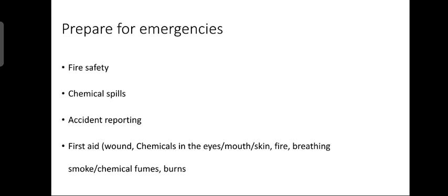Now let us see accident reporting. All injuries shall be reported to laboratory staff. Minor injuries many times are not reported because they are perceived to be embarrassing or that careless actions might have led to the accident. However, minor injuries can sometimes lead to more serious complications that only become evident at a later time. Taking corrective action as a result of a minor accident may keep a major accident from happening.